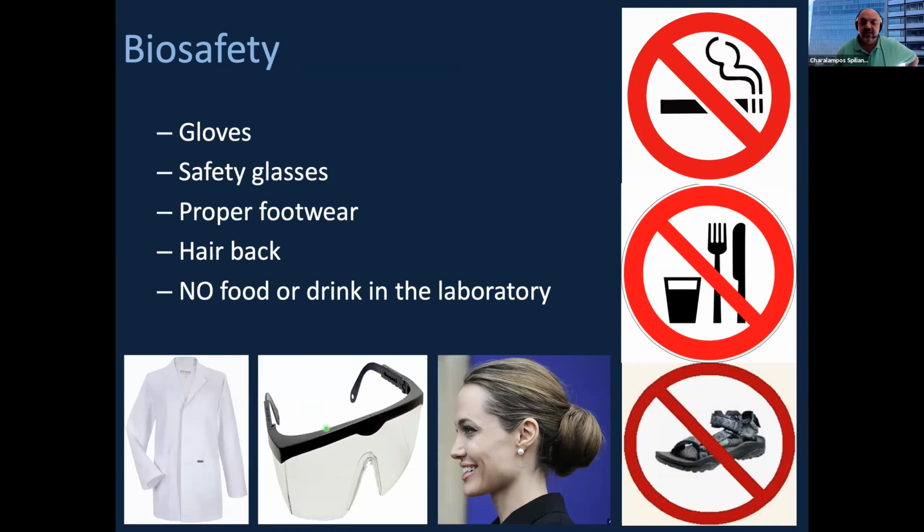Wear safety glasses. Especially ladies, if you have long hair, you should keep it on the back, okay? Keep hair on the back so it is not sweeping around and being contaminated with microorganisms. As I said, no smoking. No eating or drinking or even storing food in the lab, and wear closed-toed shoes, okay?